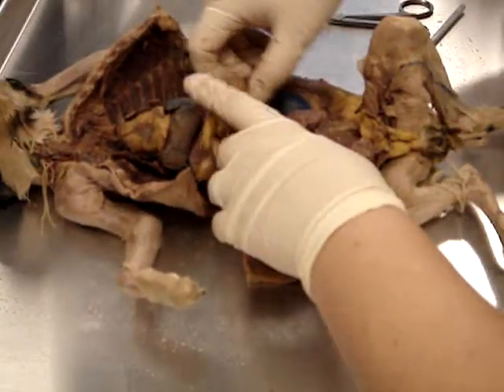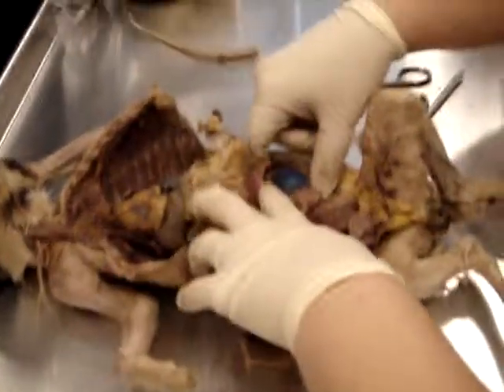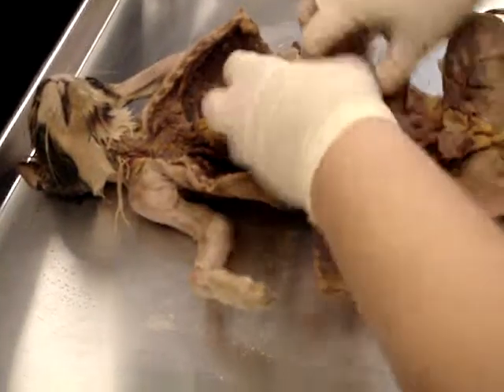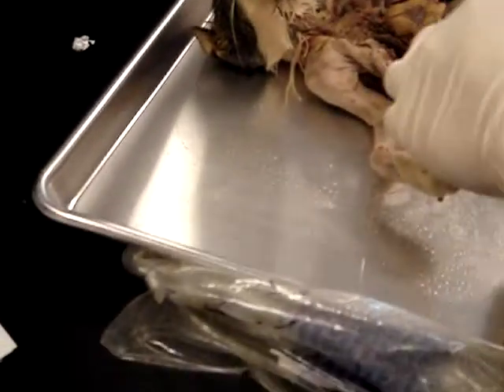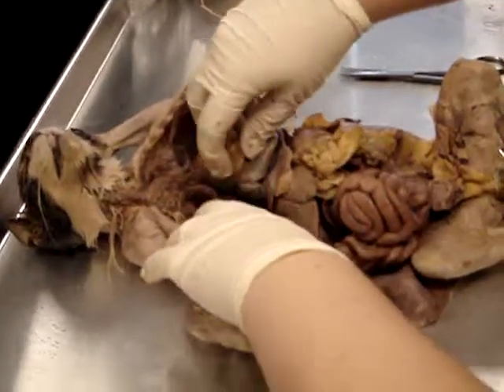Okay. So, all right. So nothing seems particularly large. We'll push the liver up in a second. What happened to the thing on the top? Nothing. It's just everything.